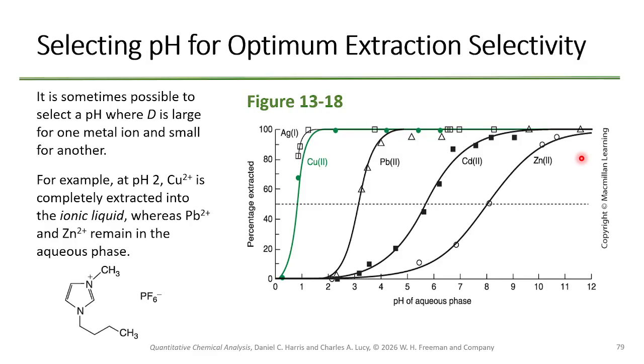Notice we're actually going to use that next week. Most of you, I don't think any of you got that done with the sodium hydroxide, right? Where we increase the pH, and that's going to mask one of our substances, right? By causing it to precipitate. Okay.